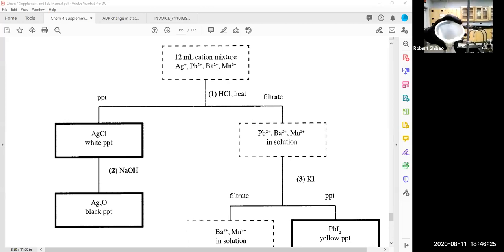So it's probably just some residual lead that I wasn't able to completely dissolve. And that's probably what we got there. And we definitely have a lot of lead here. So that's what we got so far.